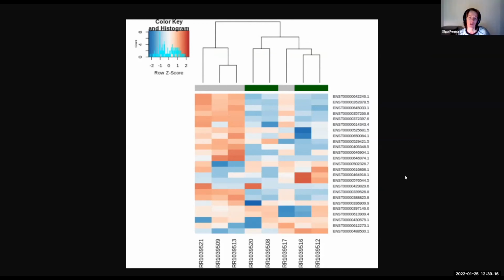But this control, which is between two greens, here's the third sample on the right. Vertically, the situation here is almost the same as for the other controls, for the first three on the left. Why is this control here between two greens? I would put it together with the other controls, or are the data not ordered by samples?